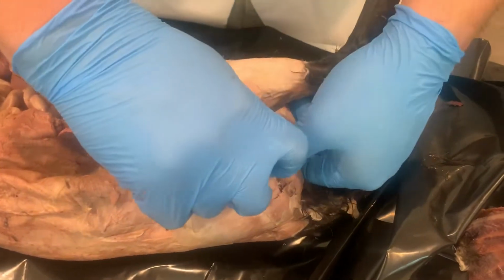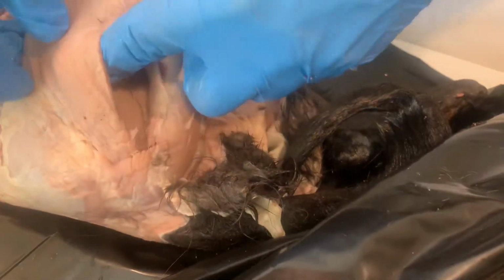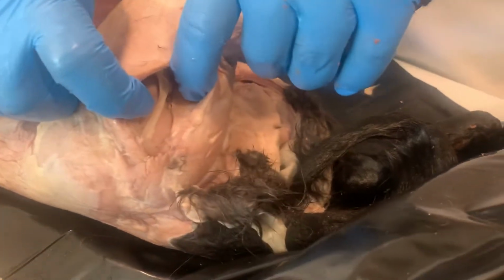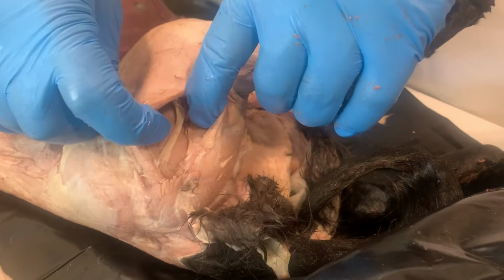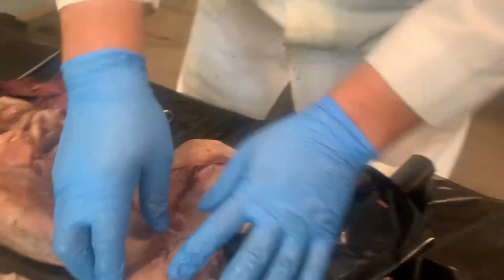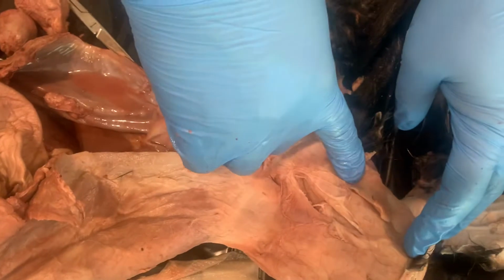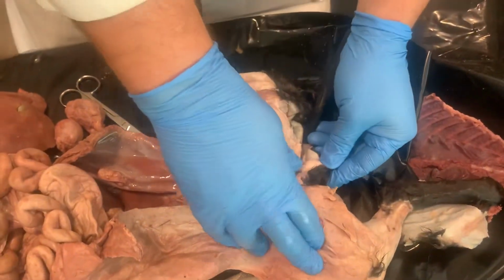All right. Look in between here, guys. You're gonna see one of the biggest nerves in the body. If I can pull it out, there it is, the sciatic nerve. Sciatic nerve is one of those nerves that's going to go down and innervate the lower leg, and so you get that big, thick nerve. That's what falls asleep when you sit down for too long, is the sciatic nerve. And here you have your femoral nerve and artery that's coming from up in there. Biceps femoris, rectus femoris.